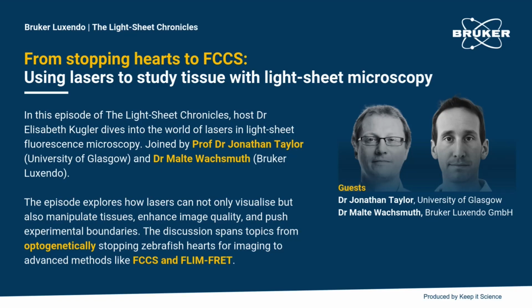And this is what light sheet microscopy has made possible by using highly sensitive cameras such as CMOS cameras, and what's emerging now is also real photon counting technology for two-dimensional camera arrays. With these tools, it's possible to generate concentration maps, interaction maps, and potentially also KD maps of interaction partners inside of a living cell, inside of living tissues.